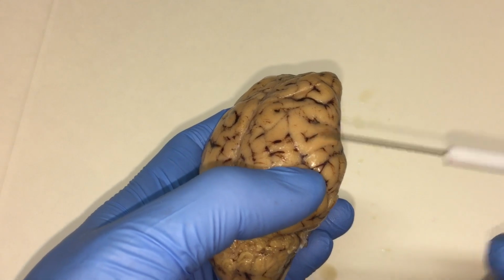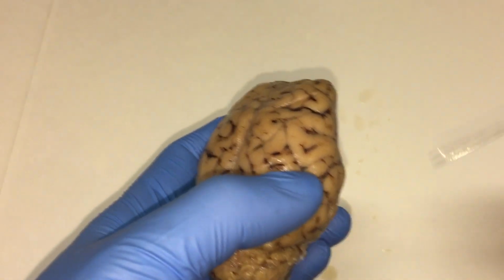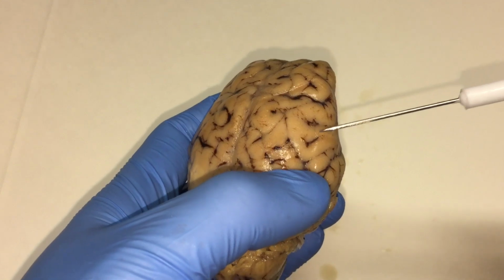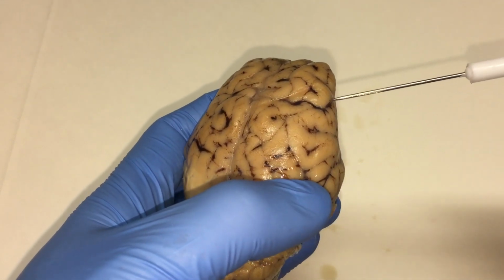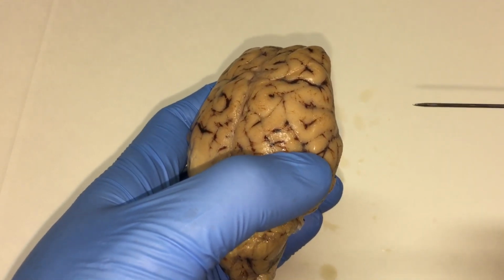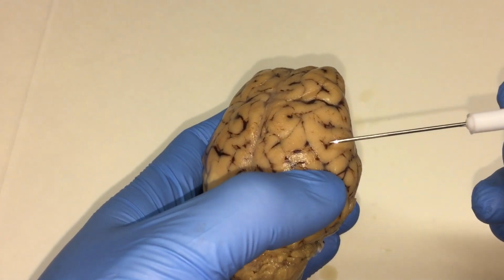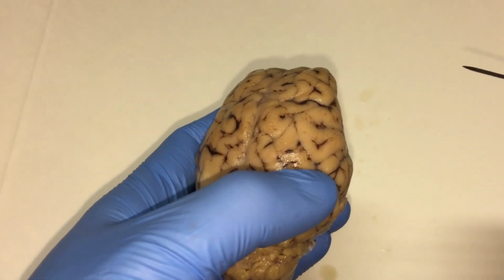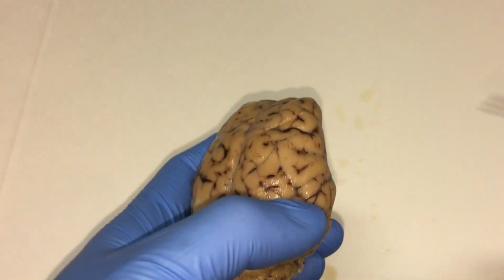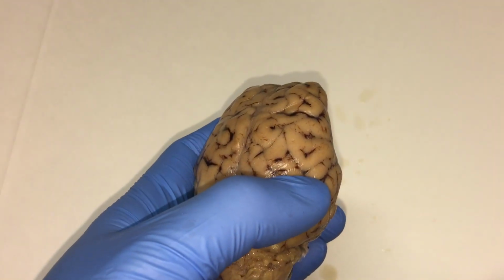And this helps to increase the surface area. So naturally though, if there's something that's raised, there's something that isn't. So that would be these darker areas like this one here and here. All together, these are sulci. A singular one though, like this one or this one right here, again, the darker areas, that would be called a sulcus. So again, this is like a fissure or kind of dips in to the surface of the brain. And these are often also referred to as valleys of the brain.